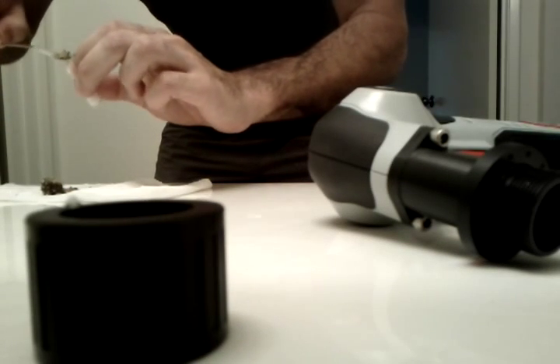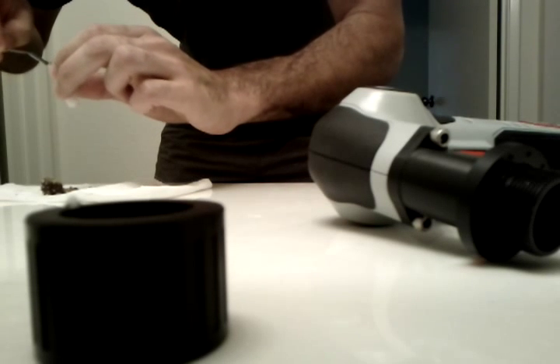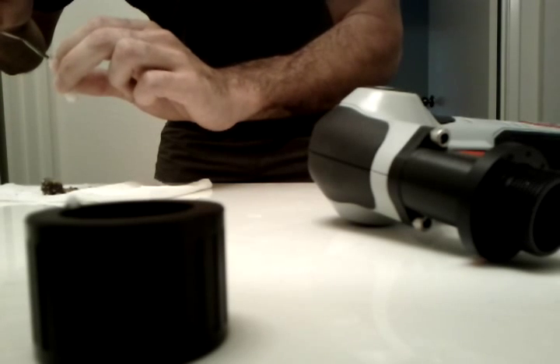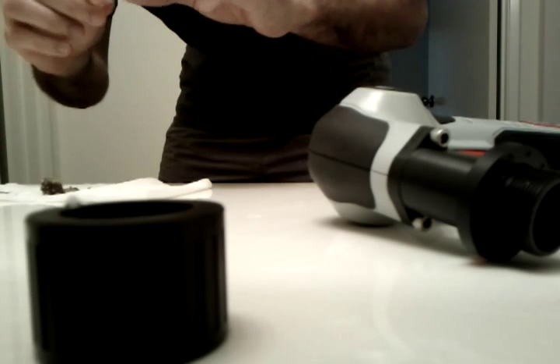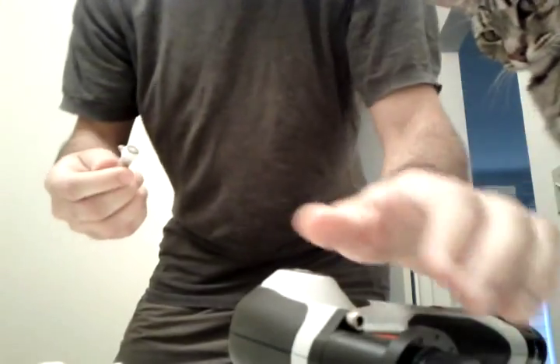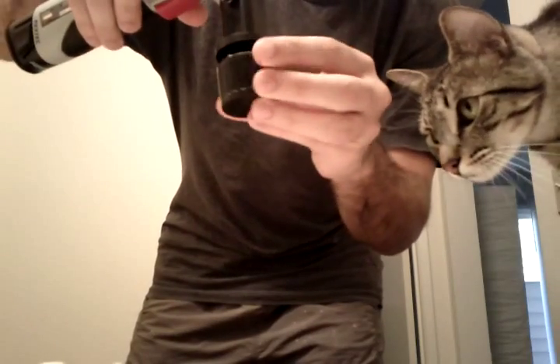So sample goes in. Get it all the way in there. There we go. Close the top. So, we put it like so, and then screw it into the sample processor.